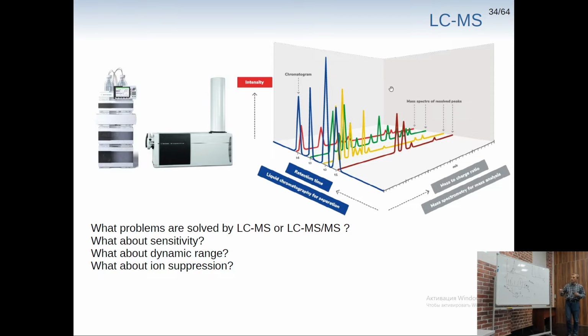We can only fragment ions which have an isotopic difference of, let's say, 1 or 0.5 or 0.33 Dalton, which is actually 1 plus, 2 plus or 3 plus ions, right? Because our peptides will mostly get multiply charged during electrospray ionization, but small molecules like SDS or whatever will most likely get only singly charged species. That also will allow us to get better results.